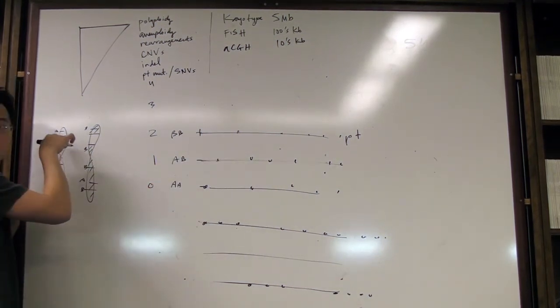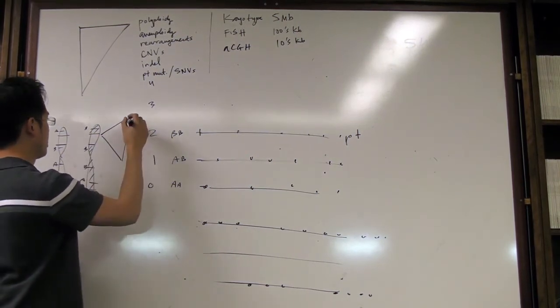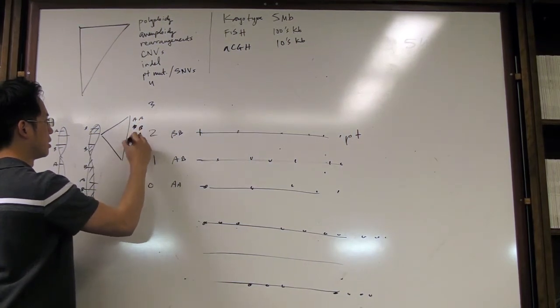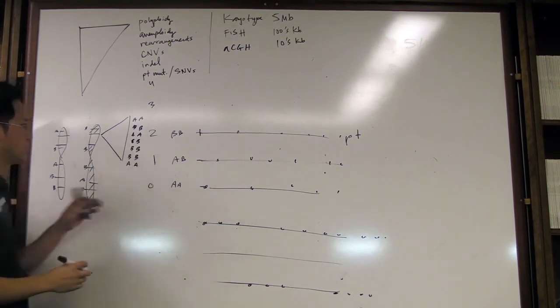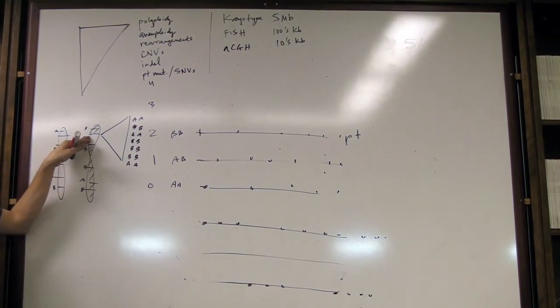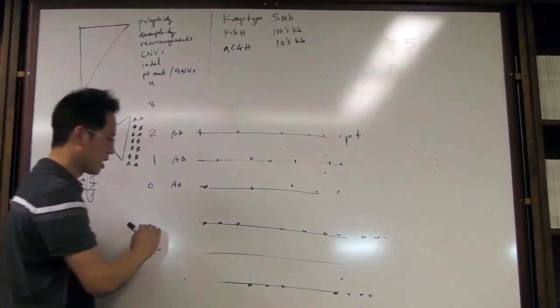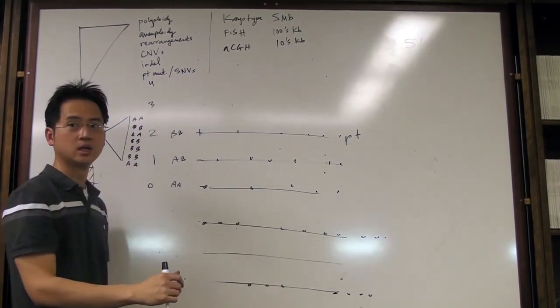But within this particular site here, I'm going to zoom in, you probably have a situation where, and the reasoning why is that this is the exact same allele from one parent. So it's a loss of heterozygosity or a long stretch of homozygosity. And you detect it by just detecting 0 cuts and 2 cuts, but nothing with 1 cut.